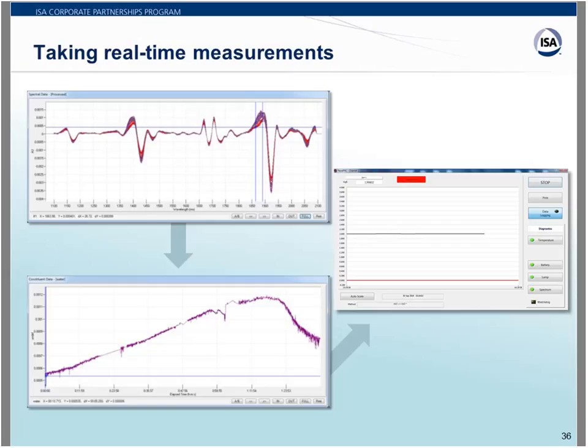The real-time measurement of moisture during the manufacturing process was programmed based on the regression model built from the top left image by selecting the spectral peaks representing the water molecule. To be more specific, the spectral peaks around the 1400 and 1900 nanometer regions are characteristic absorption bands corresponding to the oxygen-hydrogen bonds present in water.